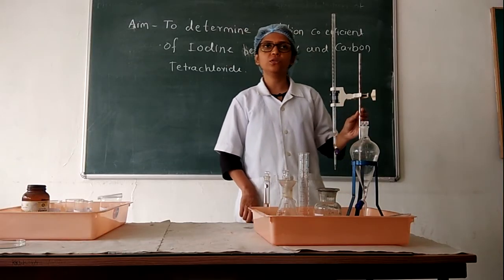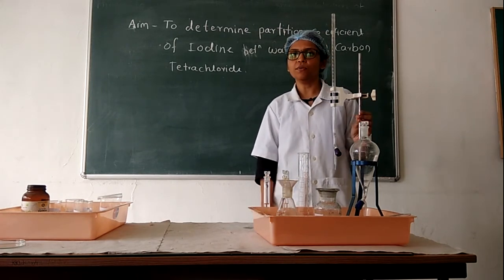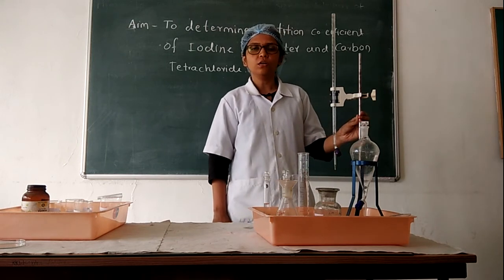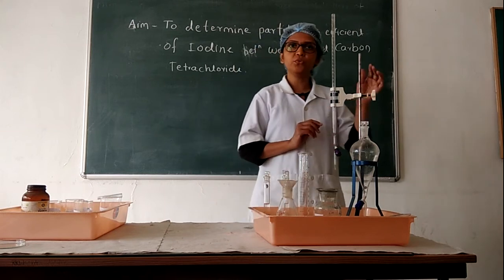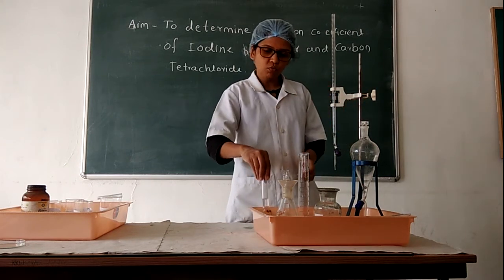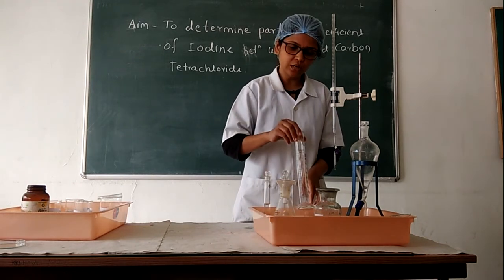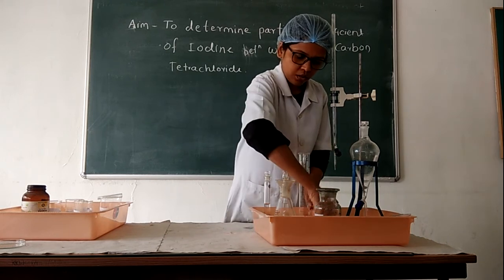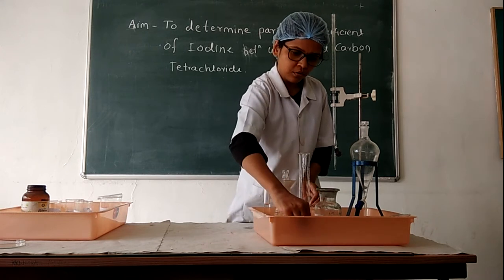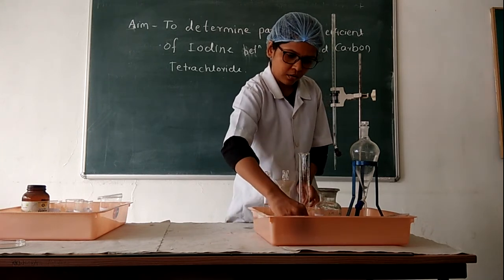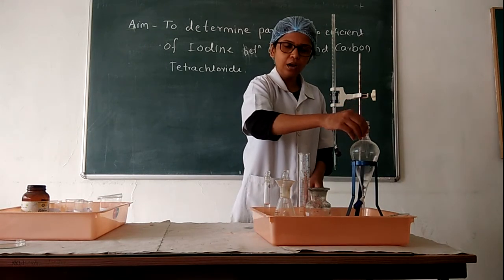Now we will see the actual demonstration of the practical for the determination of partition coefficient of iodine in water and carbon tetrachloride. The glassware required to perform the experiment includes: burette stand, burette, volumetric flask, iodine flask, measuring cylinder, beaker, glass rod, rubber bulb, pipette, reagent bottles, separating funnel, and tripod stand.